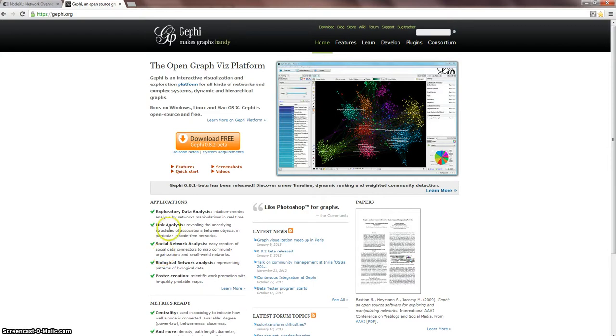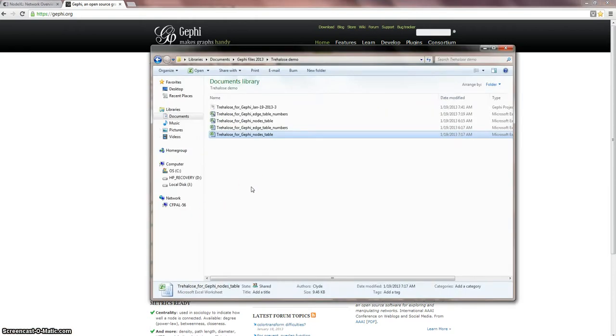In this video I will demonstrate how to generate a metabolic flux map using Gephi. Again, it will be for the trehalose pathway. What I want to do first is simply show you the folder where I have the information for trehalose mapping. I have the completed one. It's not really completed, but it's close. These can take quite a bit of work, and then hopefully they end up being a nice template for other studies where you're looking at the same pathways.